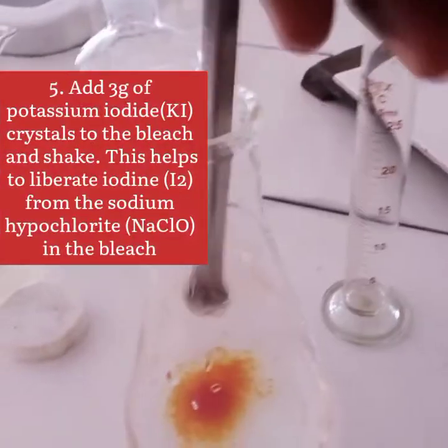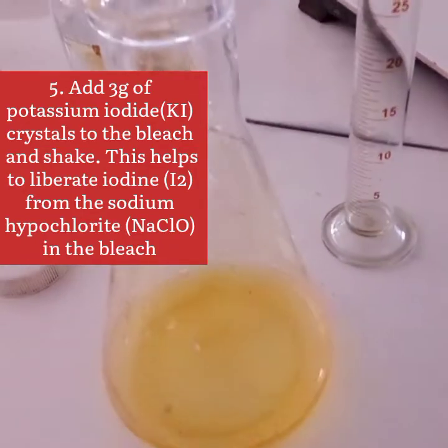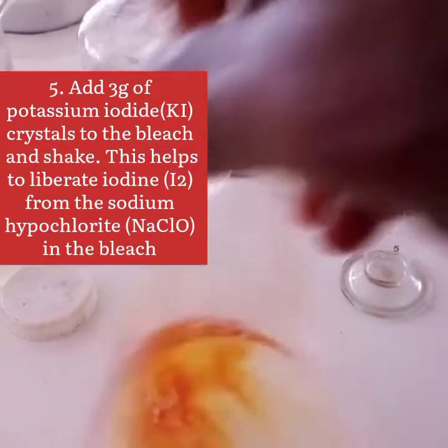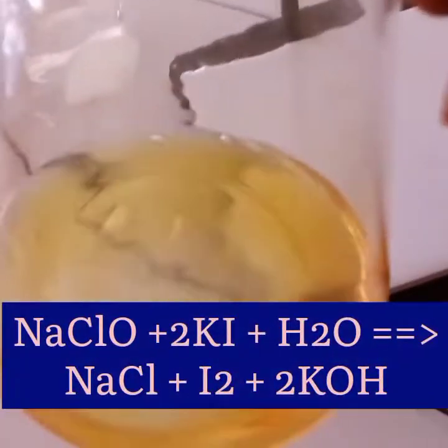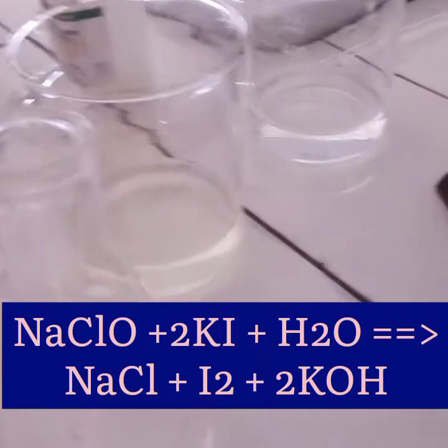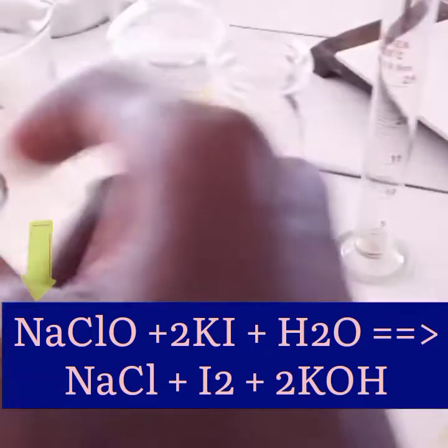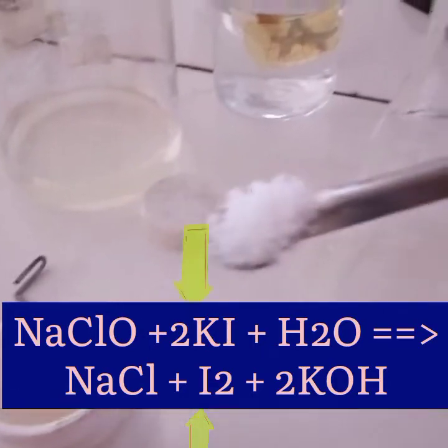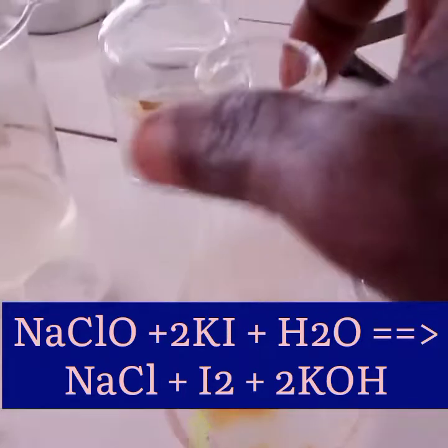The next thing is to add 3 grams of potassium iodide to the bleach and shake. This helps to liberate iodine from the sodium hypochlorite in the bleach. The bleach contains sodium hypochlorite, so the potassium iodide helps to liberate iodine from it.